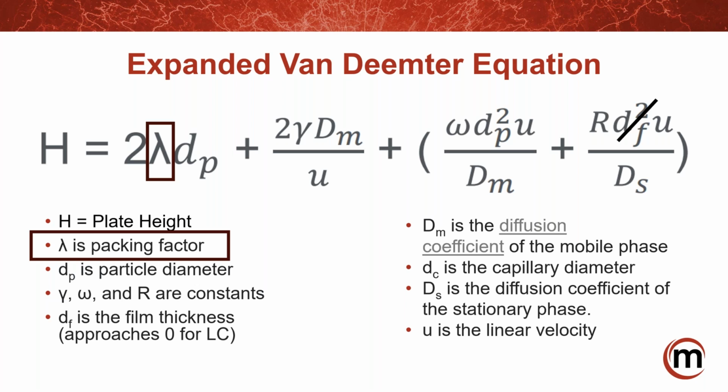So it's more so as the hydrodynamic volume of that analyte gets bigger and bigger, and the pore is structured, then you start to have some resistance as it's turning and moving in and out of the pore.